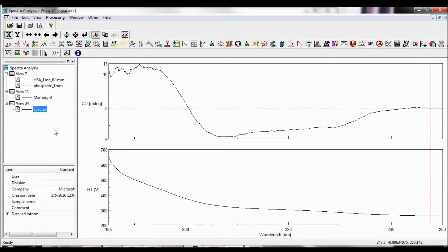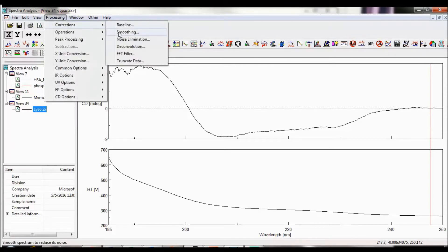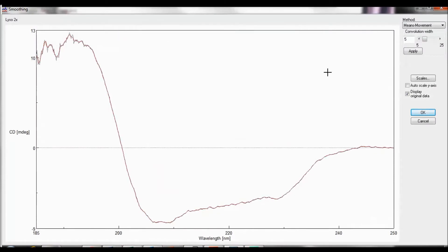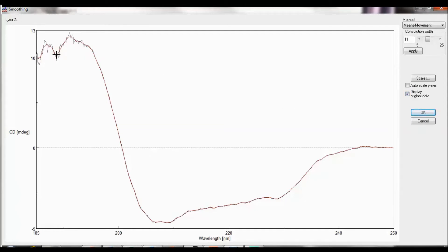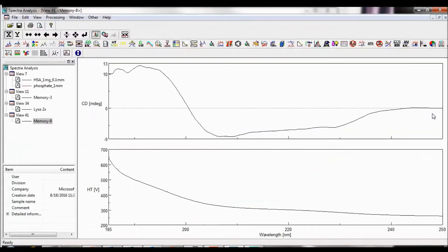If you have a particularly noisy spectrum, you can use the smoothing function to reduce the apparent noise. To smooth your data, either select the Smoothing icon in the Processing toolbar or go to Processing, Corrections, Smoothing. Four different smoothing methods are available. The convolution width sets the number of data points to be averaged on both sides of each data point. Selecting Display Original Data shows the original spectrum displayed in gray in the spectrum display area with the smoothed spectrum overlaid in red. Click OK to set the parameters. A new memory is now created.